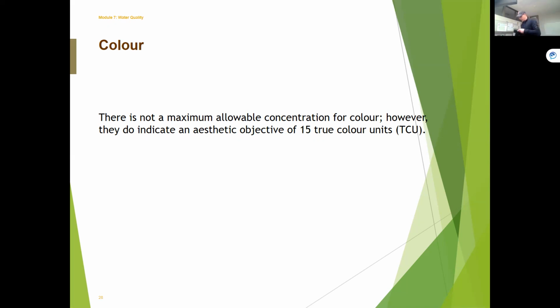You know, we've come a long way, I think, in the industry. And I'll show you this. This is a Turbidity Meter that was used not too long ago. And look how old this thing is. We've got much more sophisticated units now, but this is an old NTU meter, probably early 80s. They were still using this type of stuff. A lot older. Again, our turbidity meters are much more robust now.